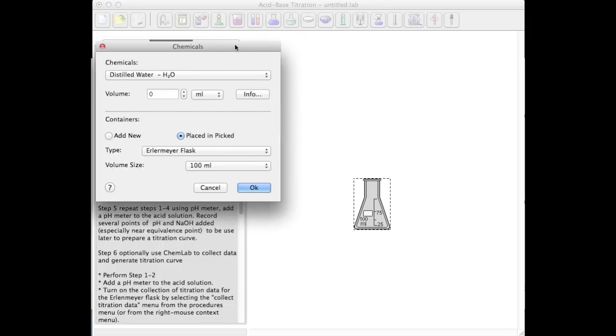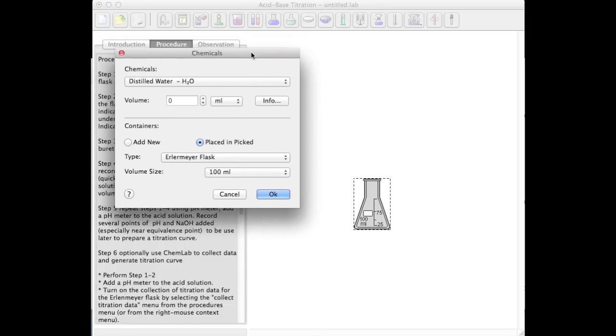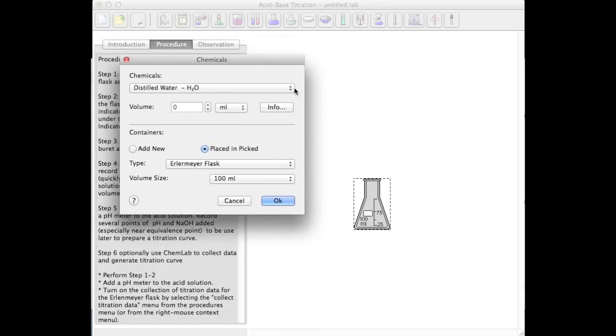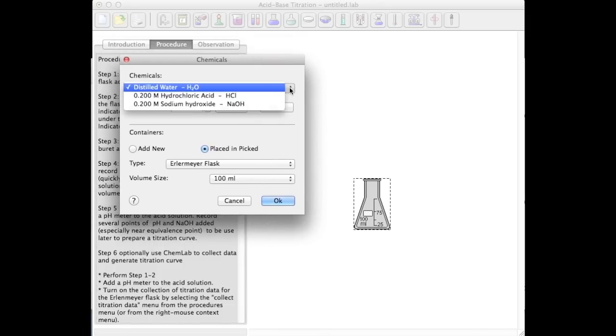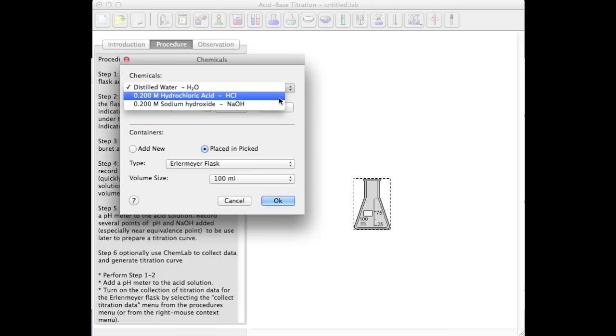First thing I'm going to do is add a flask and add some hydrochloric acid to my flask.